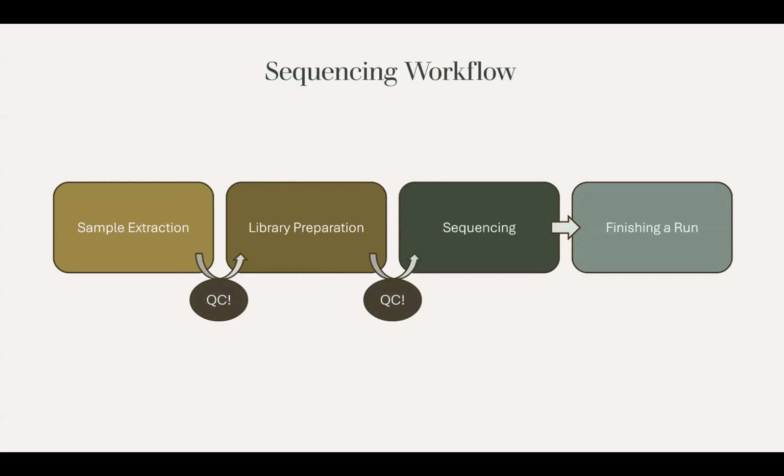Crucially, a huge component of this that I've found extremely necessary is making sure to check the quality of your samples between steps and even within the library prep protocol.